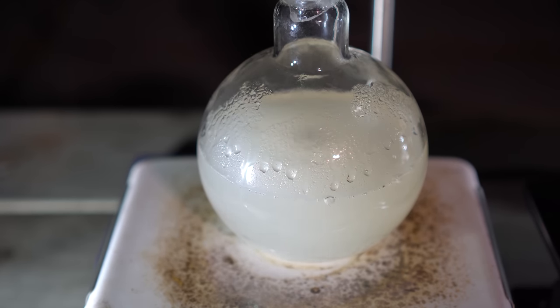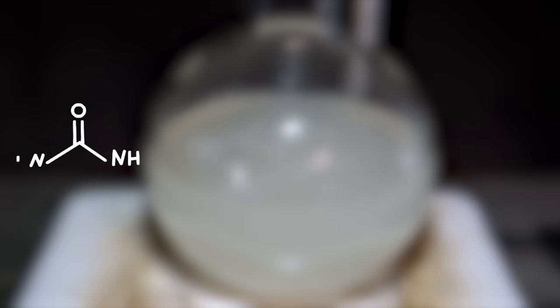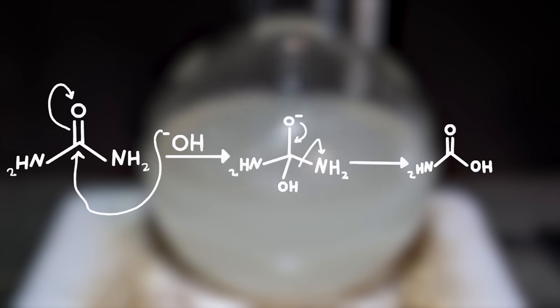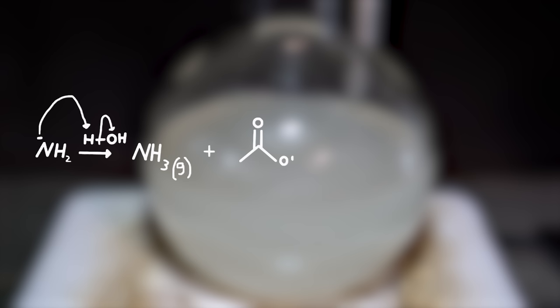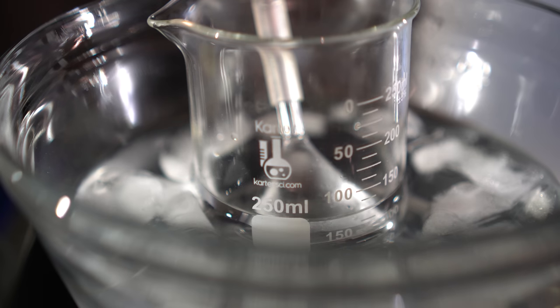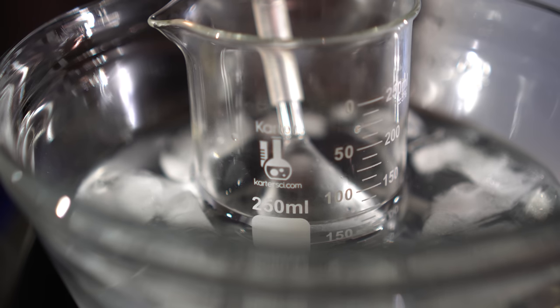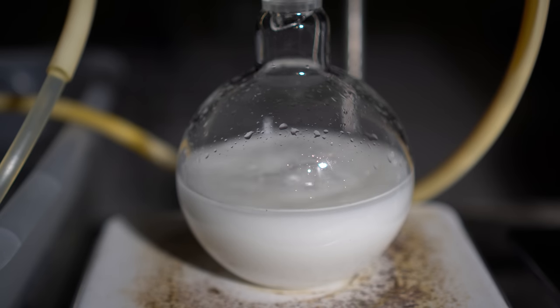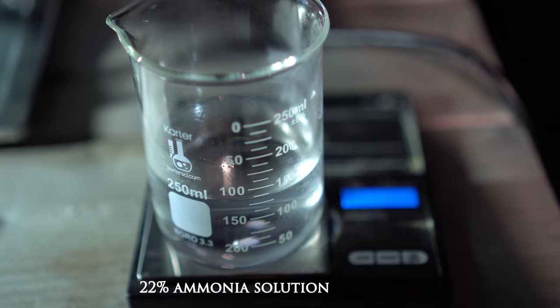I used just enough heat to maintain reflux but no more, as it's unnecessary. The mechanism here is base-catalyzed amide hydrolysis: hydroxide attacks the carbonyl, expelling the azenite anion, which takes a proton from water. The process repeats, ultimately giving sodium carbonate and a lot of ammonia gas. The sodium carbonate build-up makes it a little harder for the stir bar to work. I let the reaction run for about two to three hours, which gave me a pretty concentrated ammonia solution — it absolutely reeked outside. After doing the math, we got a 22% ammonia solution.